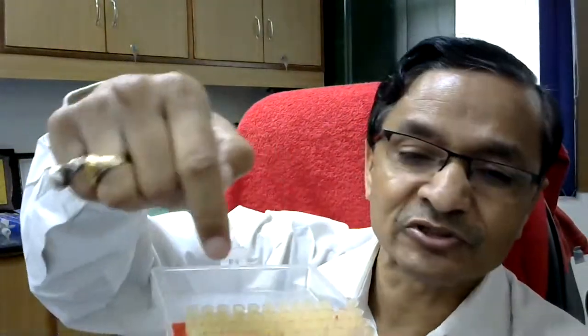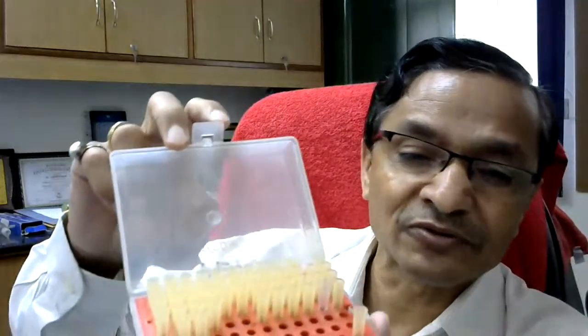If you are using a 200 microliter pipette, you should know which pipette fits with which tips. Generally, for a 1 ml or 1000 microliter pipette, blue tips are used, and for 20 microliter and 200 microliter, yellow tips are used. This is the yellow tip box, and you can see so many tips kept here; you can just pick one tip and do it. After filling it, we autoclave and sterilize it, so whatever contamination is there is removed. You have to be very careful which pipette will fit with which tips.